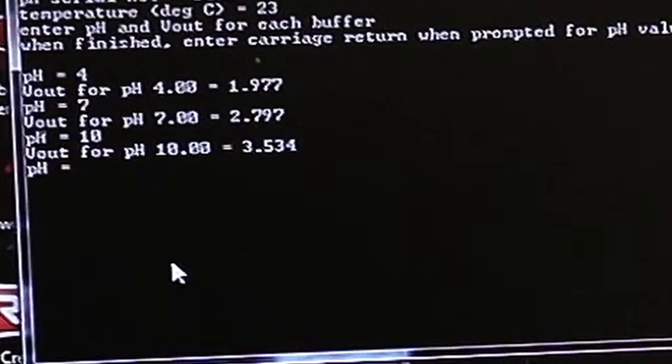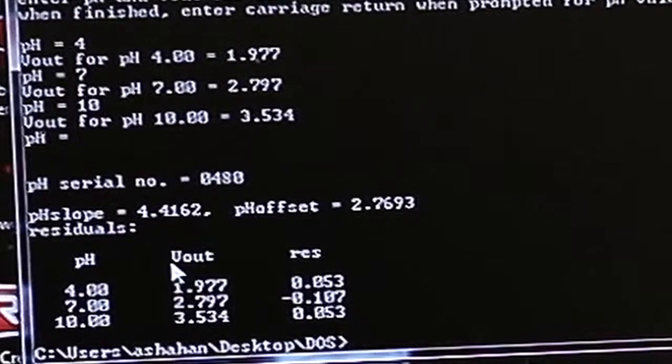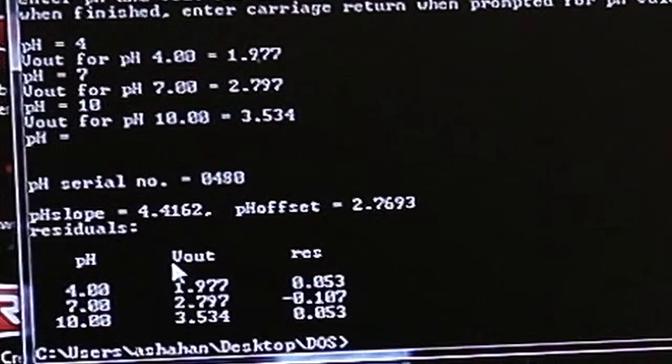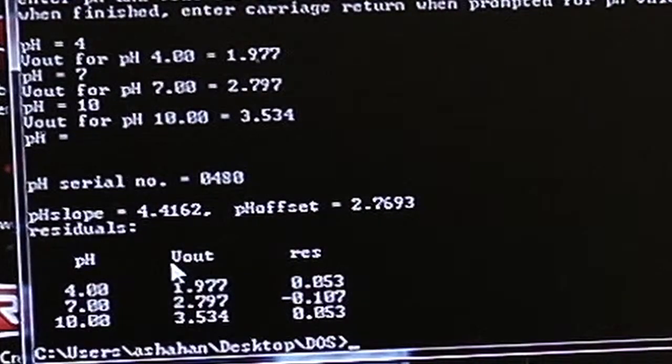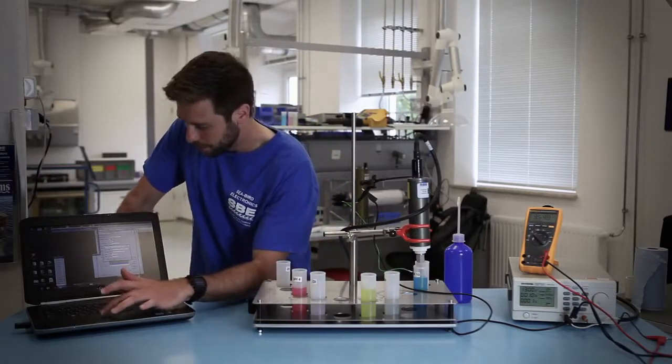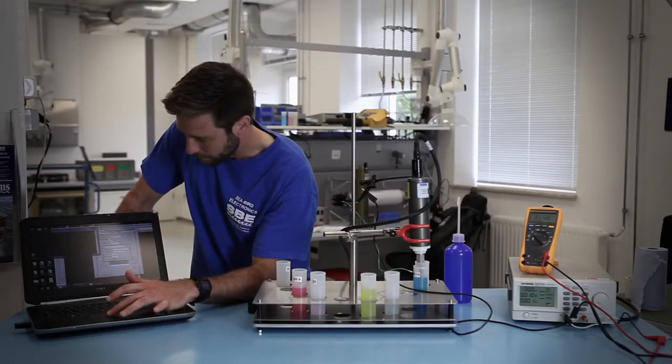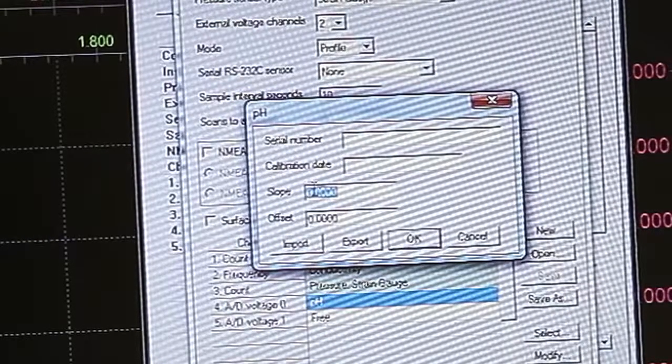Once you've entered in the last value you'll just hit enter again in the program and it will give you a Vout for each sensor for each solution. It'll also give you a new slope and pH offset that you will then use to enter into the instrument configuration file.